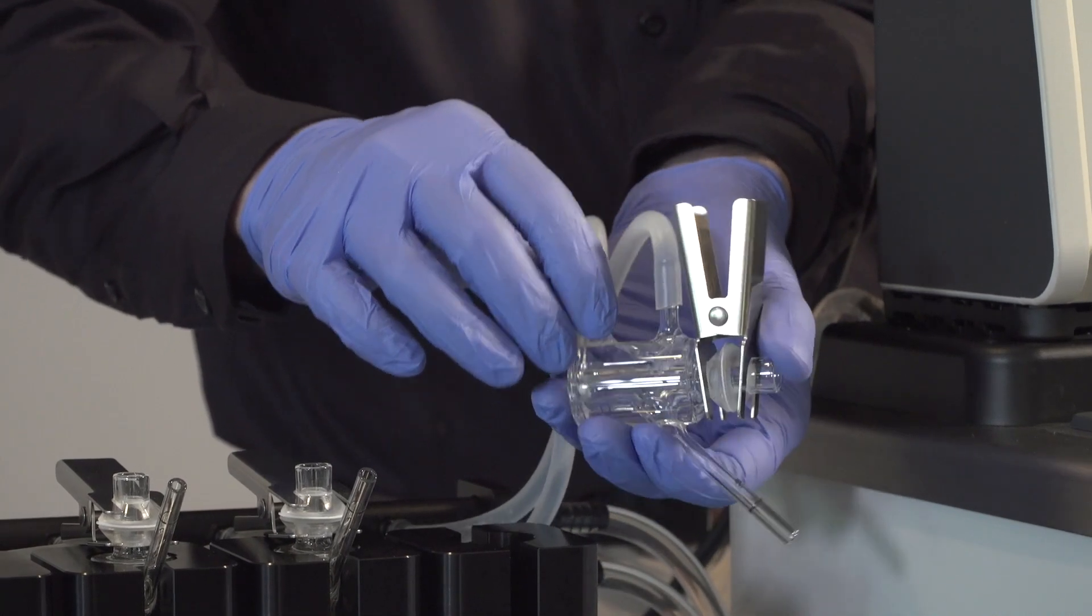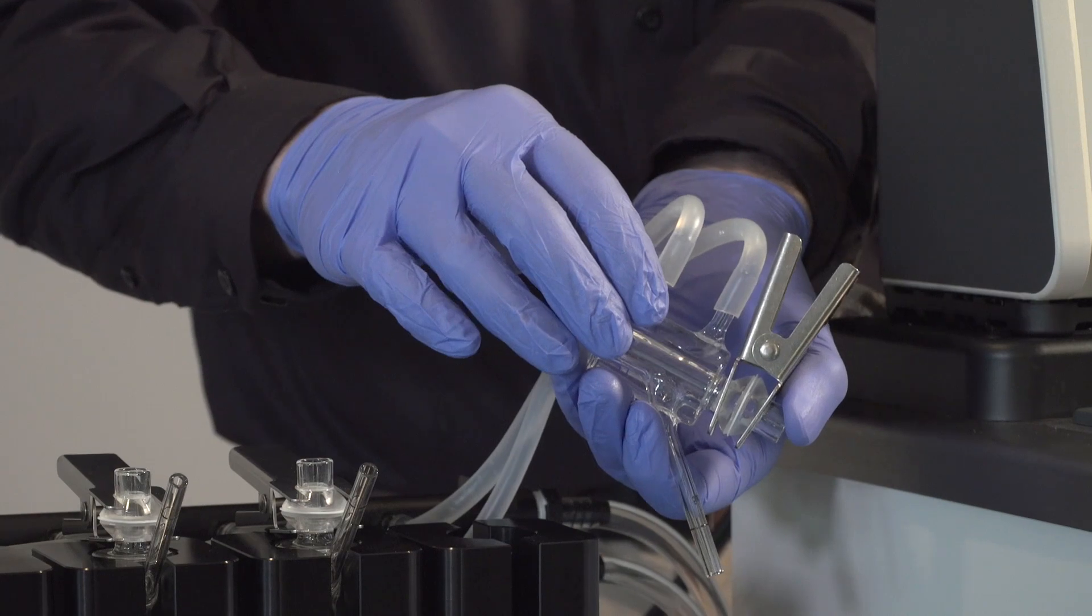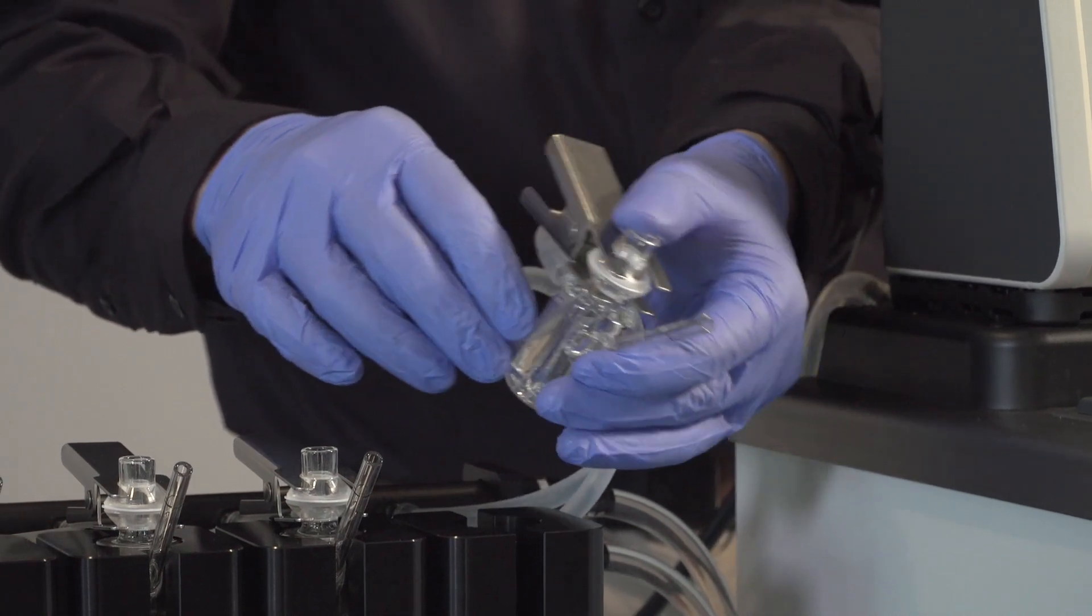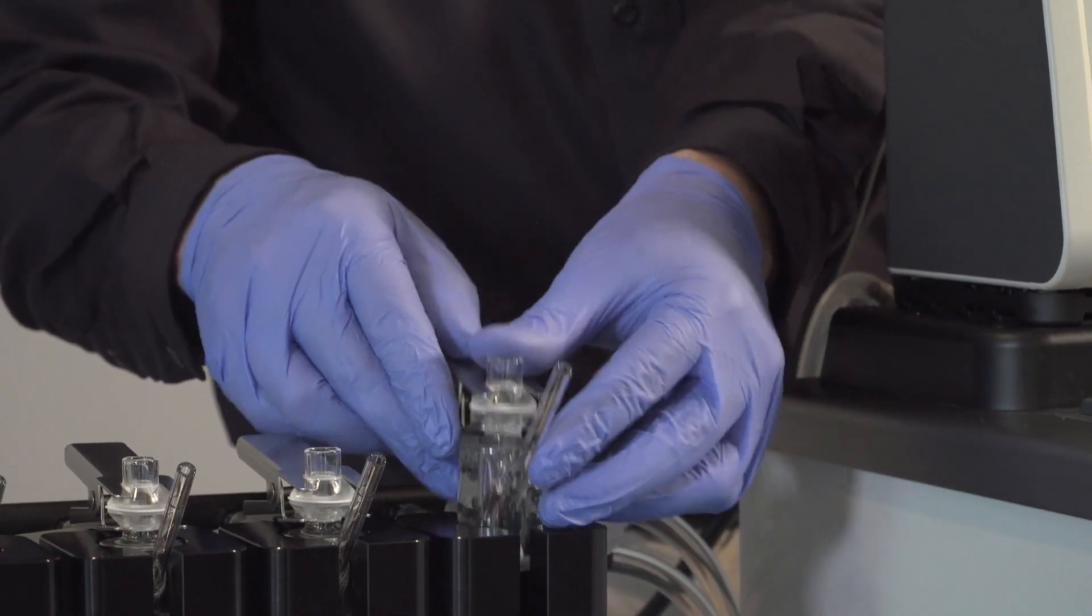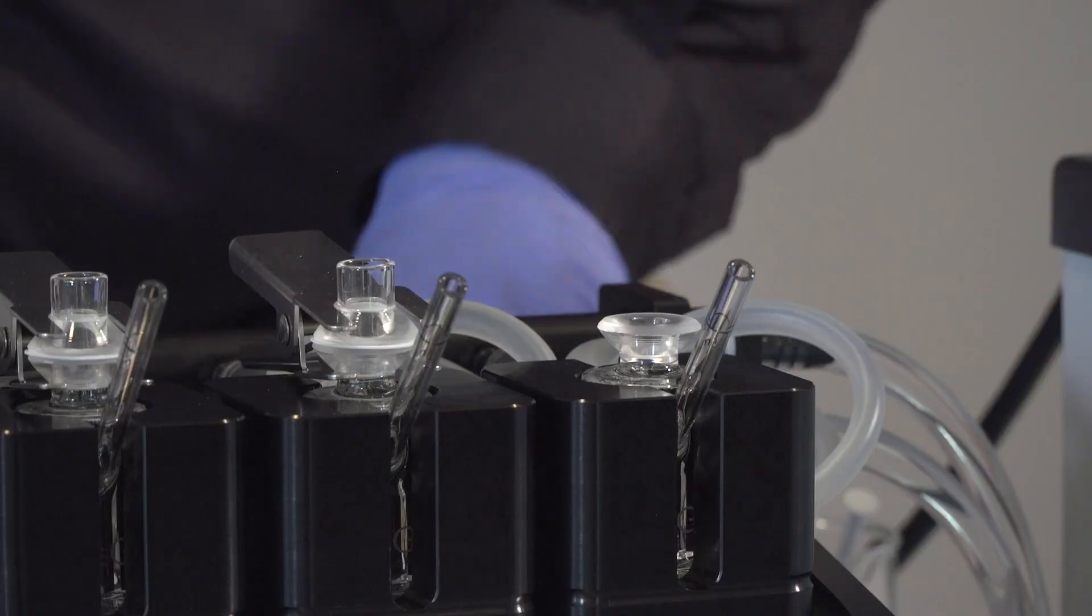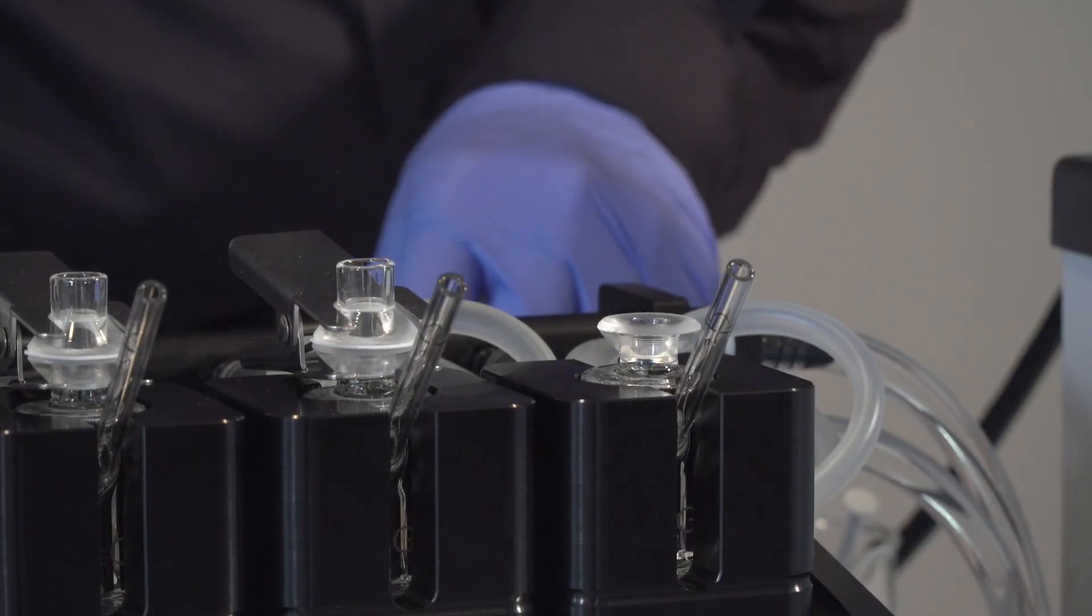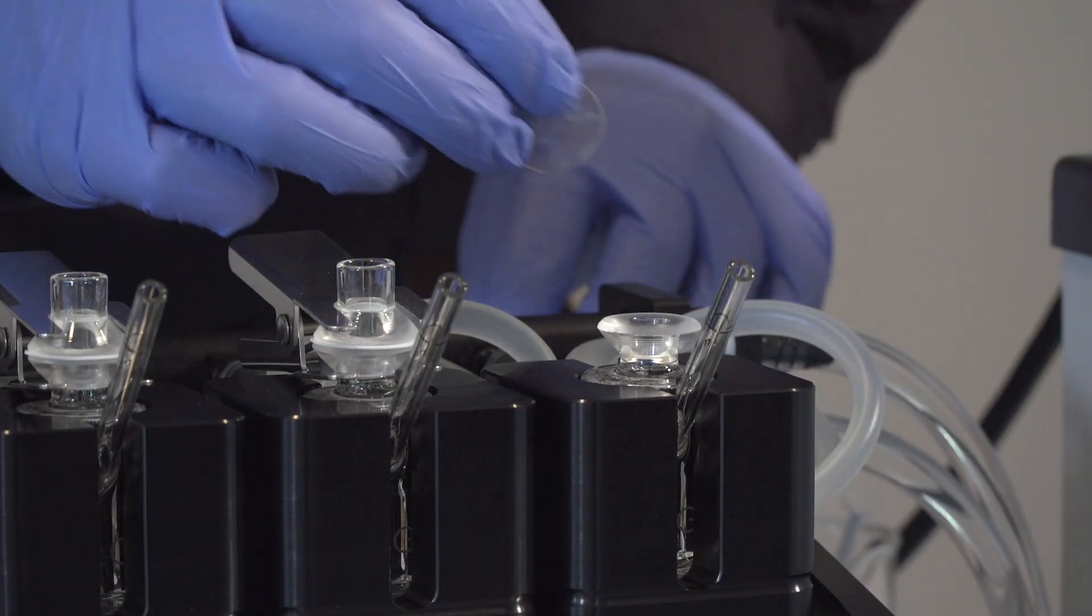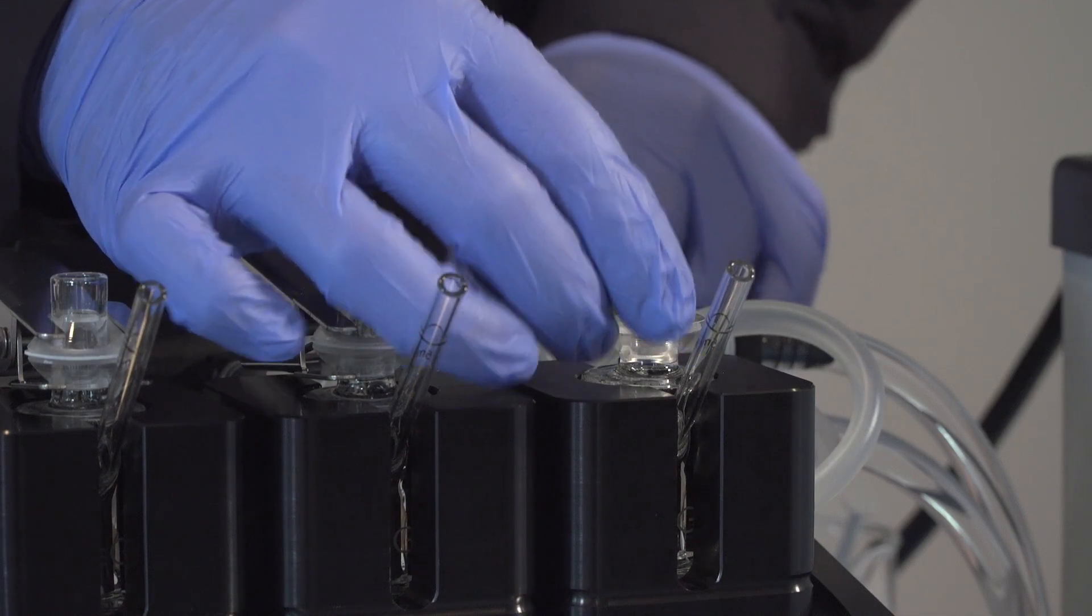When the bubbles have been removed from the water jacket, slide the cell into the stand. Place a membrane on top of the cell and secure it in place with the donor chamber in the clamp.